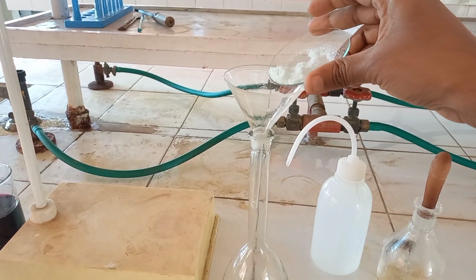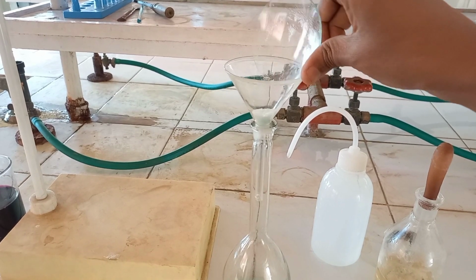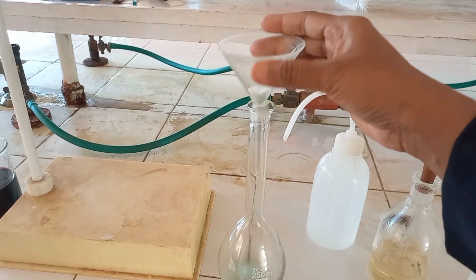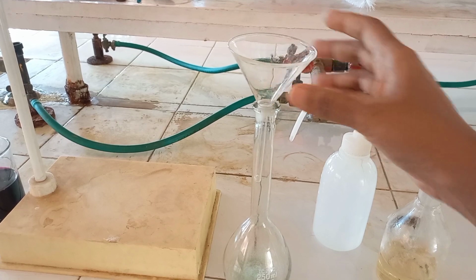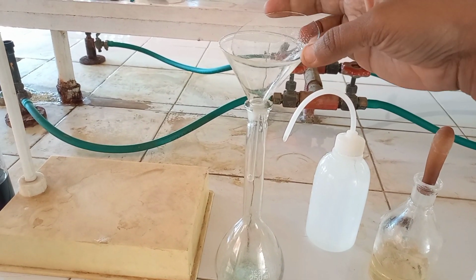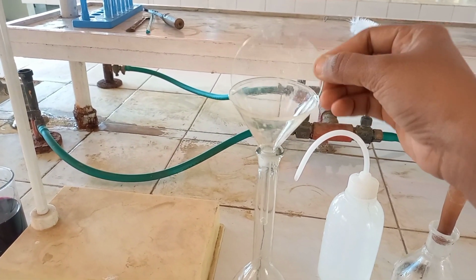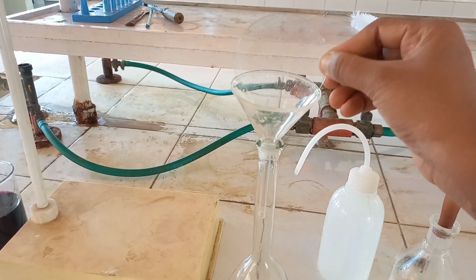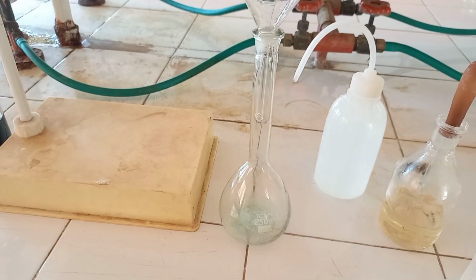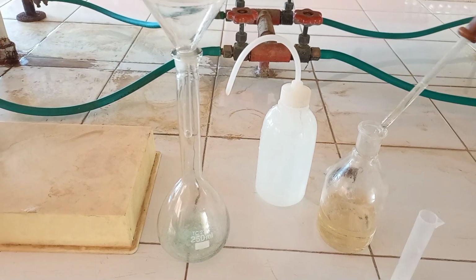Be careful while pouring this salt. Add a small quantity of salt first, and then you can pour the complete salt. After pouring it, shake the funnel a little bit, and then the complete salt will go down into the standard flask. Then you can see that some salt is still sticking on the watch glass. So with the help of the wash bottle, we will transfer the complete salt into the standard flask.